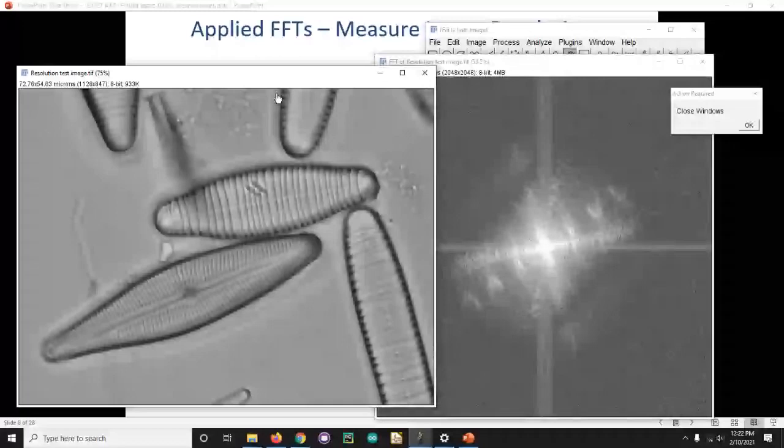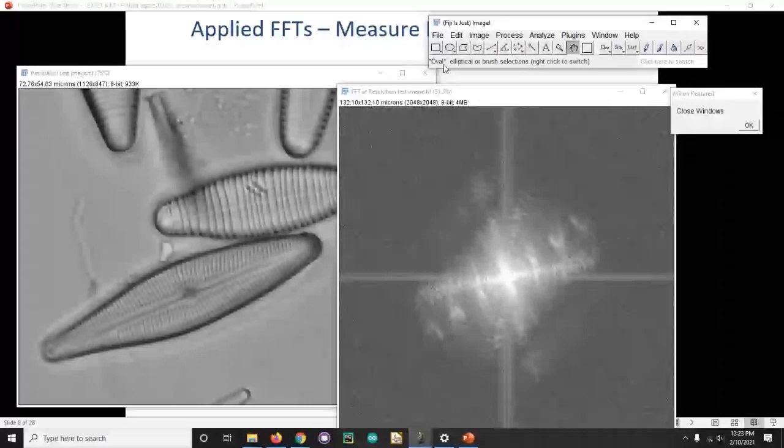And so now we can go out onto our Fourier transform, and we're asking, so here's our background noise. These are very, very high frequencies, but we have no signal out there. So this is the actual modulation above background in our image. So by simply asking, what is the highest frequency above background? So let's take my cursor out. And so here we can see, if you look up at the title bar, about 230 nanometers per cycle. So just by using a Fourier transform, we can real quick assess what is the actual resolution of my image.